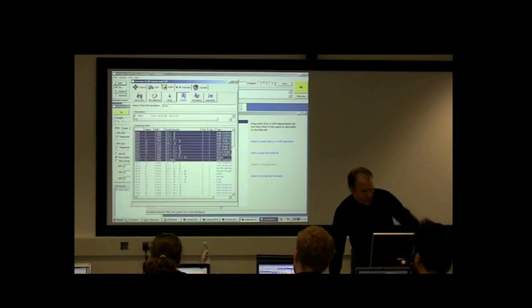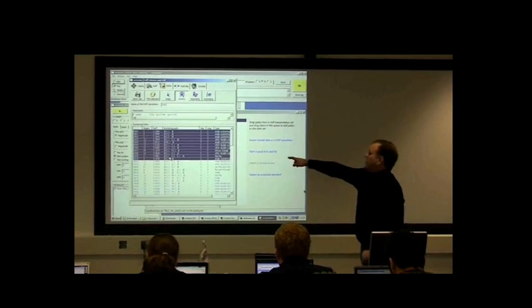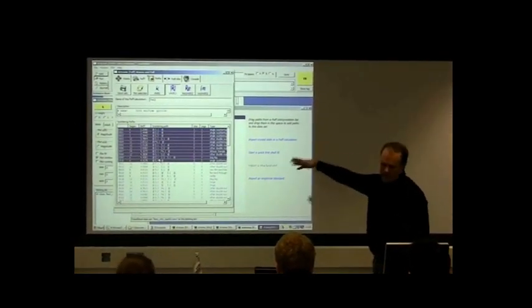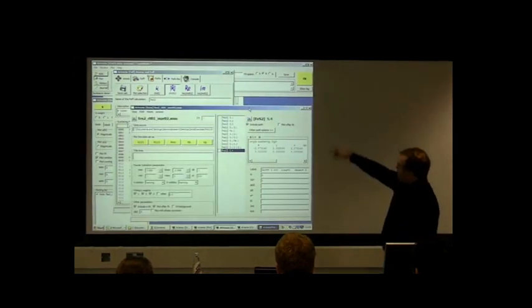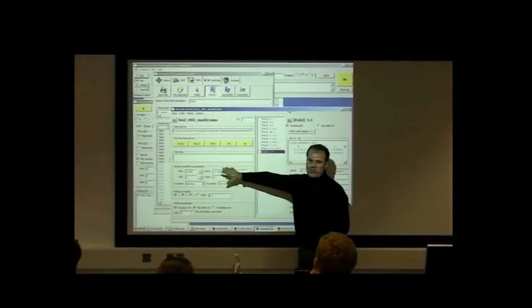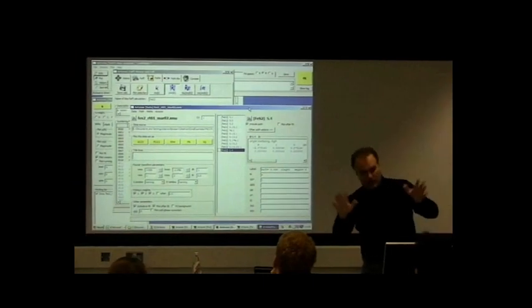Shift-click on the one that's the 11th one, the one that's 0010. And that selects that whole first block of paths. I'm then going to click, drag, and drop them over here. And now what's happened is all those first several paths have now been associated with this data. It'll all make sense in a second.